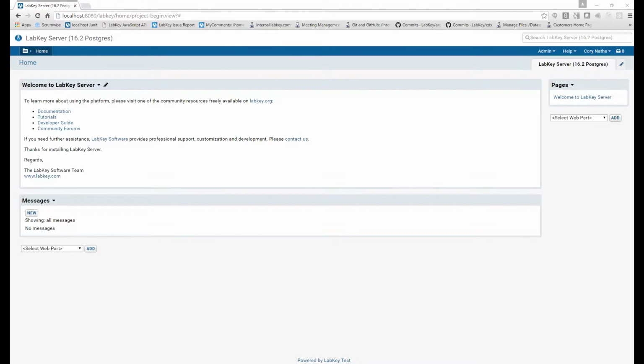We've added several types of workflow features to the LabKey product. Several of these workflows include email notifications that might go out to a given user, notifying them of some change to the data or some action that they need to take within the system. As we've added more of these email notifications, we've also wanted to centralize the way that they can be viewed from within the LabKey server itself.